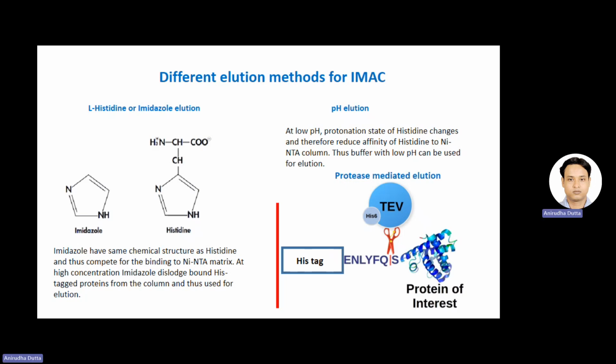So now there is another question. If you are adding a protease, which is also a protein, would it not contaminate or add impurity to our preparation? Our purpose is to purify protein or remove all the unwanted other proteins. In this case, we are adding another protein to our mixture. So how would it get removed from the preparation?